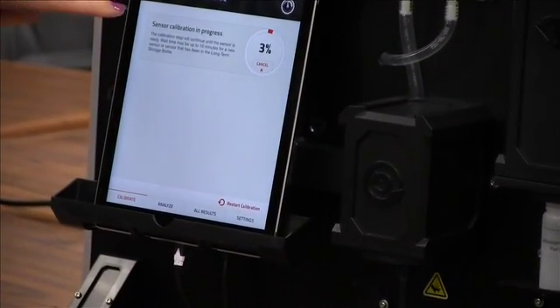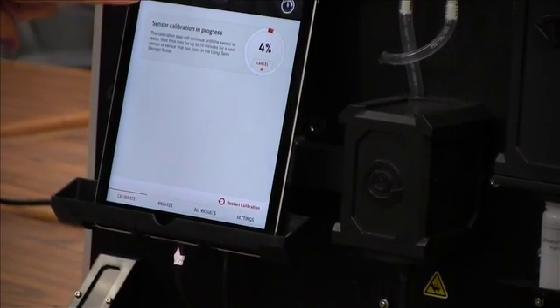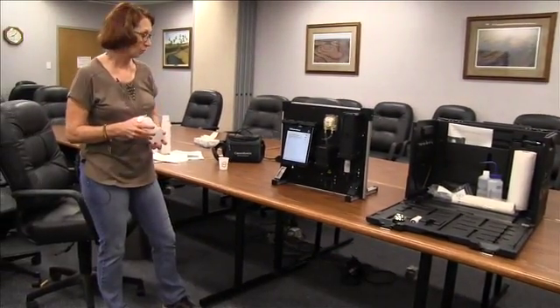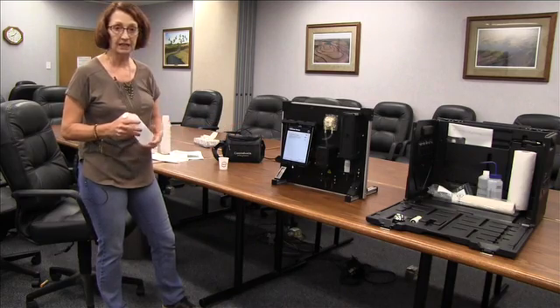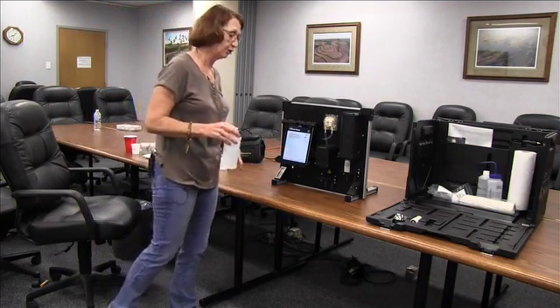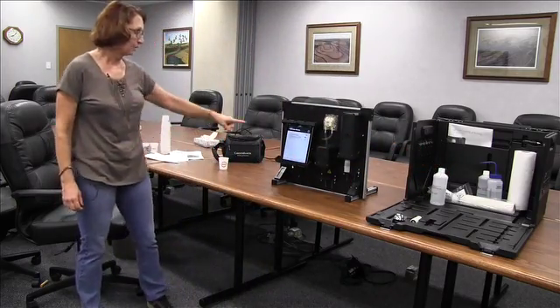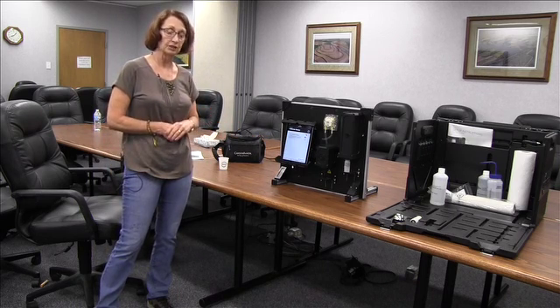The unit is now calibrating itself to that 20 parts per million solution. If something is wrong with the unit or the calibration solution has been contaminated, it will give you an error message. You then have the option of using a fresh calibration solution or checking through diagnostics. It is pretty self-explanatory — it really walks you through step by step what you need to do.